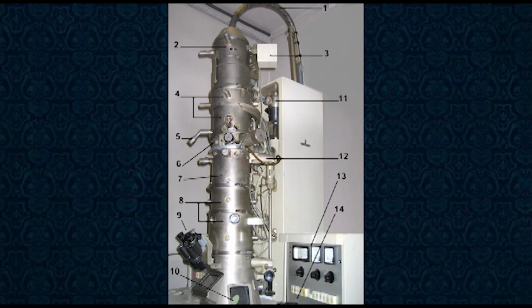In order to maximize the mean free path of the electrons as they travel down the apparatus, the entire microscope needs to be evacuated to a pressure of around 10 to the negative 4th pascals. This is achieved by first utilizing either a rotary vane pump or diaphragm pumps to achieve a low vacuum. Then, a turbomolecular or diffusion pump is used to create the high vacuum necessary for proper operation.